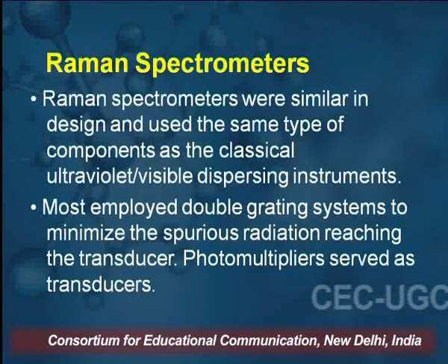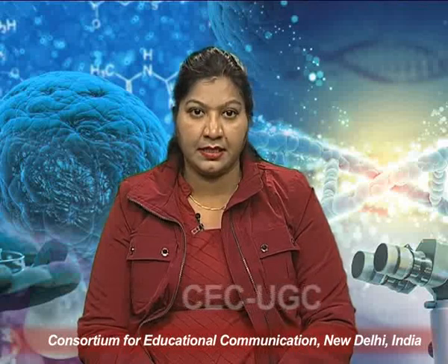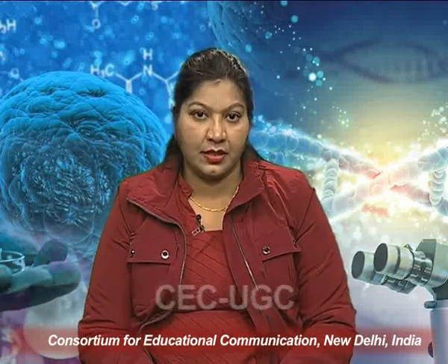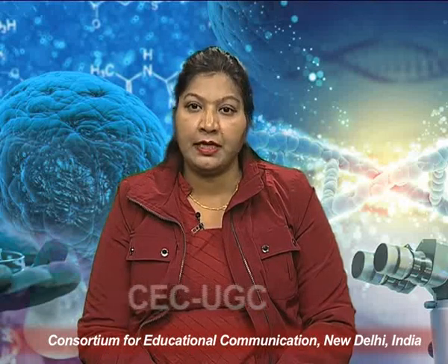Most employ a double grating system to minimize, as we are seeing here, that we are getting the fine scattered light. So it is very important to use the double grating or many gratings, so that the sharp radiation with less noise will reach the transducer. The photomultiplier serves as a transducer, which means the detector must get the fine output because of the fine output from the double grating. So the photomultiplier gains the output light from the sample that produces the Raman scattering.